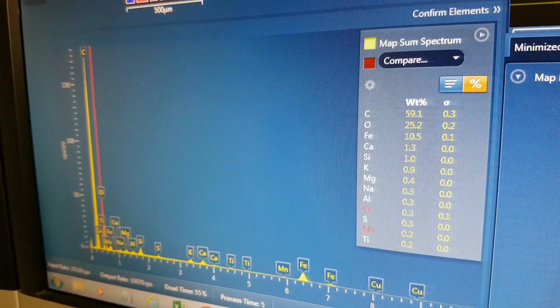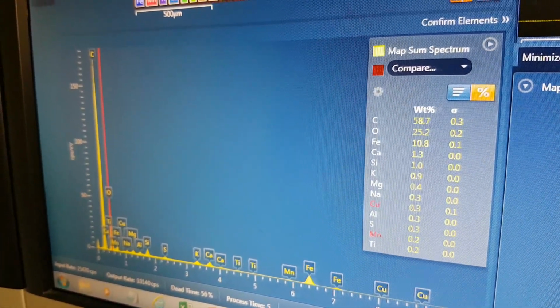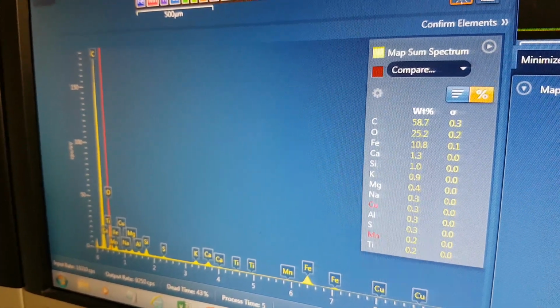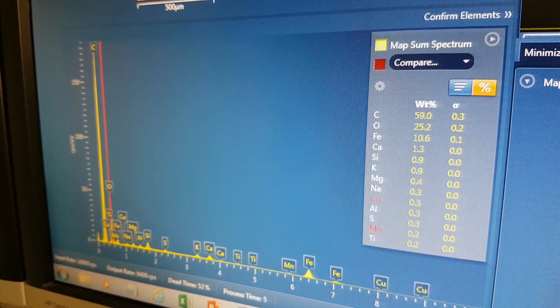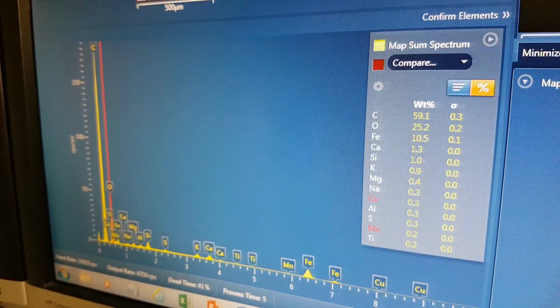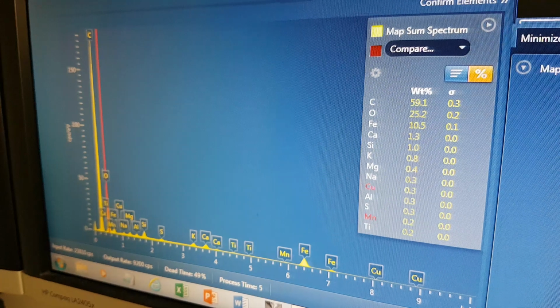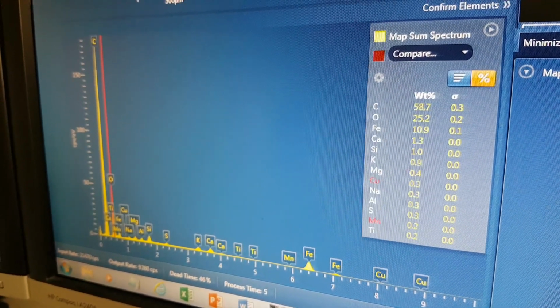Okay. Yeah, literally it's all the Ohsawa chain reaction products. Nothing but. Obviously carbon and oxygen is the highest there. You would expect that being open to the air, you're going to get carbon dioxide or carbon monoxide or whatever. Carbon and oxygen. Oxygen's on everything else, I guess, that's oxidizing. The iron would be oxidizing. Okay, so I think let's pause that sampling.